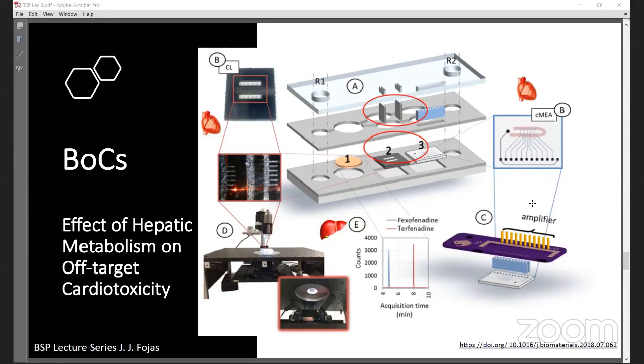So our current in vitro assays do not fully represent physiology, as I have mentioned so many times now in this lecture, often lacking xenobiotic metabolism. So in this work, the authors use functional human multi-organ systems containing iPSC-derived cardiomyocytes and primary hepatocytes maintained under flow using a low-volume pumpless system in serum-free medium. And so you see here that the functional readouts for contractile force and electrical conductivity enable the non-invasive study of your cardiac function.